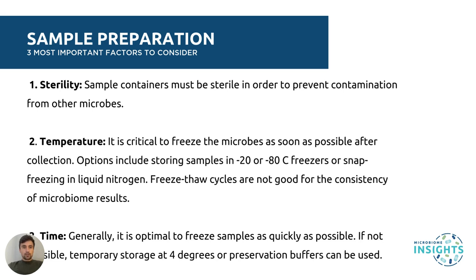Temperature is also important to consider. It's important to freeze your samples as quickly as possible after collection. Depending on your resources, you can store them at -20 or -80 degrees, or use snap freezing in liquid nitrogen. This helps to preserve the microbial DNA.